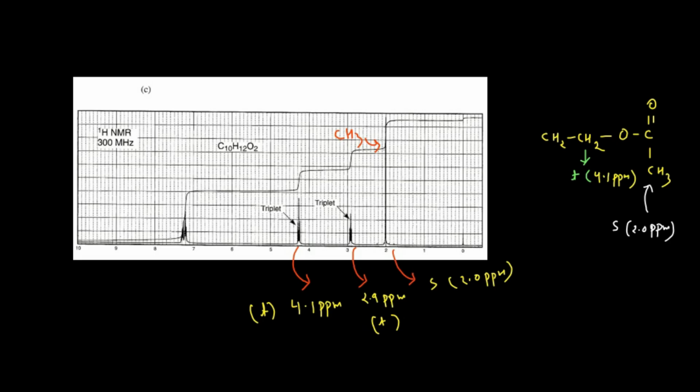Now if you count 1, 2, 3, 4, four of your carbons are engaged here, and then you are having this benzene ring. Again, due to the anisotropy produced by the circulating electron cloud, this signal will go downfield.